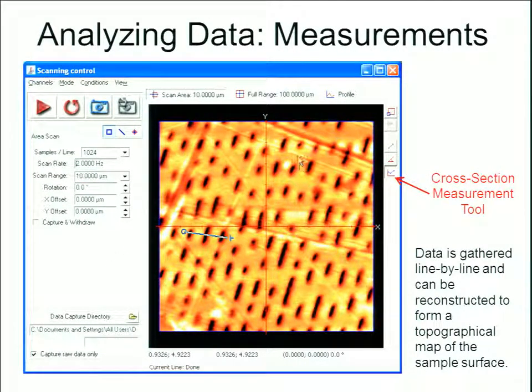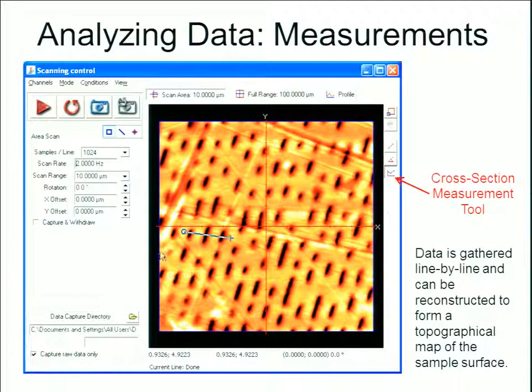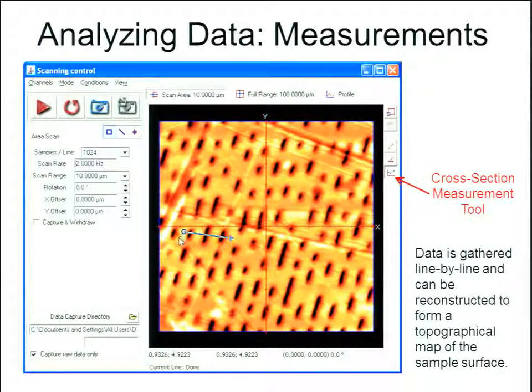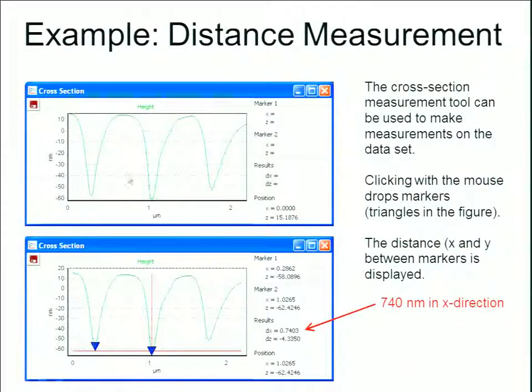We've seen this image before — our DVD scan. Now we'll show how to take a quick measurement within the software. You select a cross-section measurement tool and click and drag. The great part of an AFM image is that it's not just a picture — it may be over a million data points plotted. Because you have all that information, you can quickly click and drag to generate a cross-section profile.